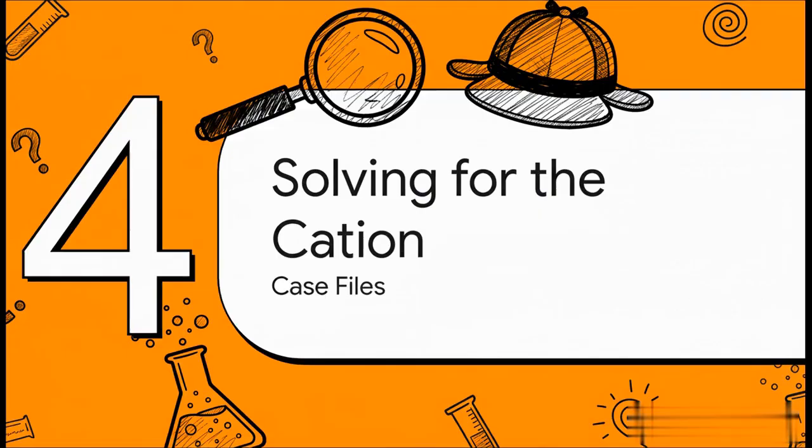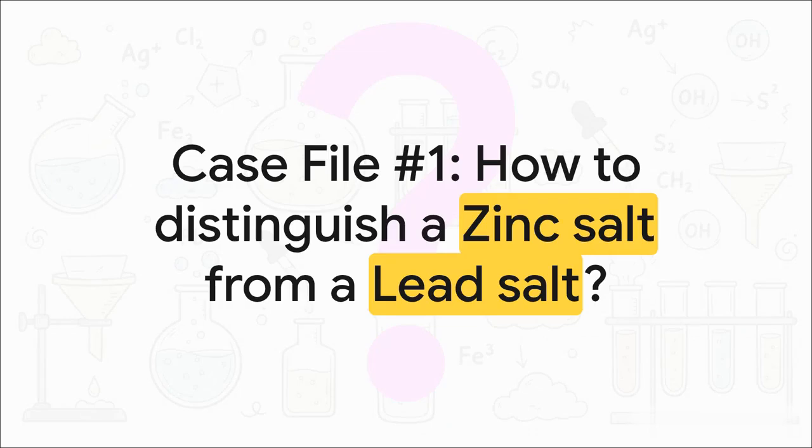All right, we've gone over the evidence. Now it's time for the fun part, putting it all into practice. So let's put on our detective hats and solve a couple of classic cases, the kind you are absolutely going to see. So here's the scene. You've got two test tubes. Both have clear, colorless solutions inside.